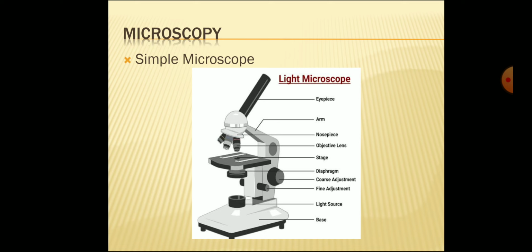The working of the simple microscope takes place like a refracting telescope but with minor differences. A telescope must gather a large amount of light from a dim, distant object, and so it needs a large objective lens to gather as much light as possible and bring it to a bright focus.